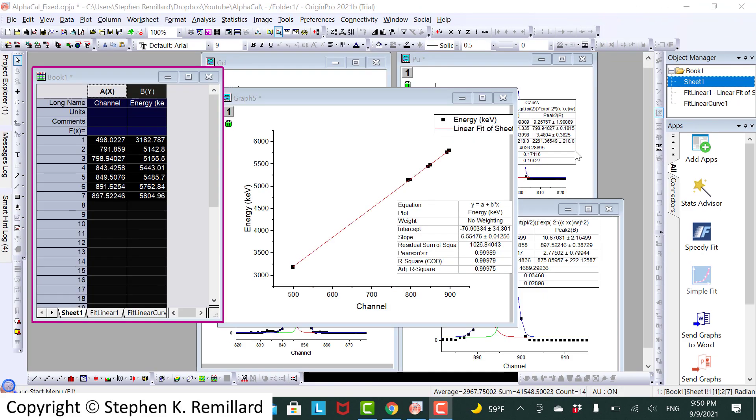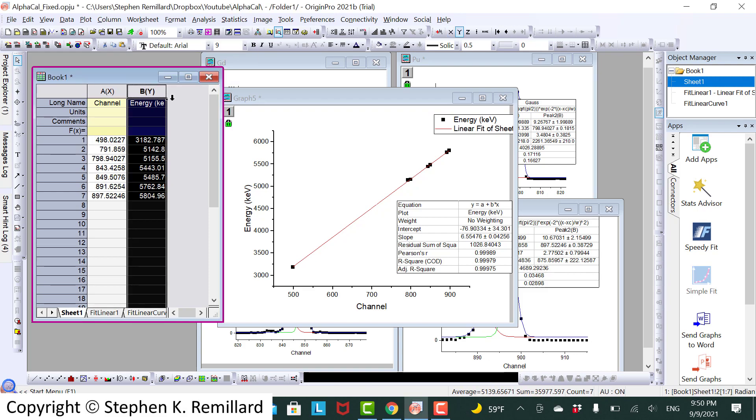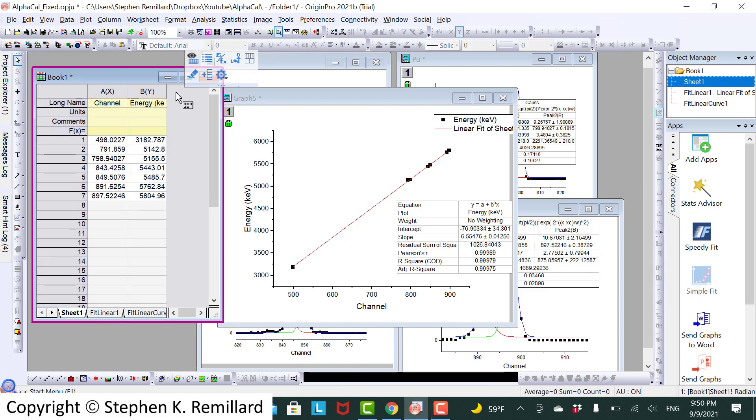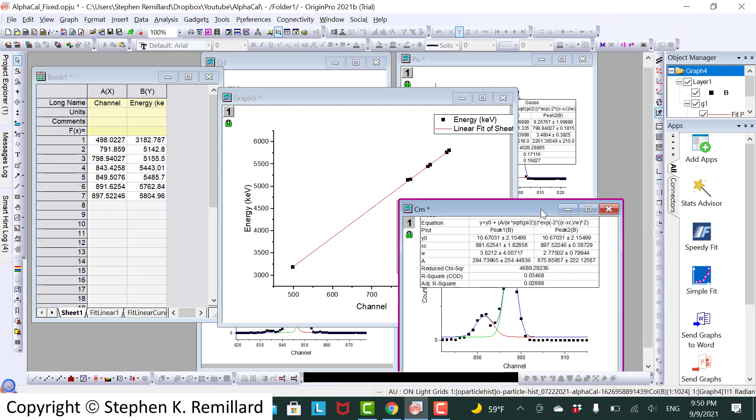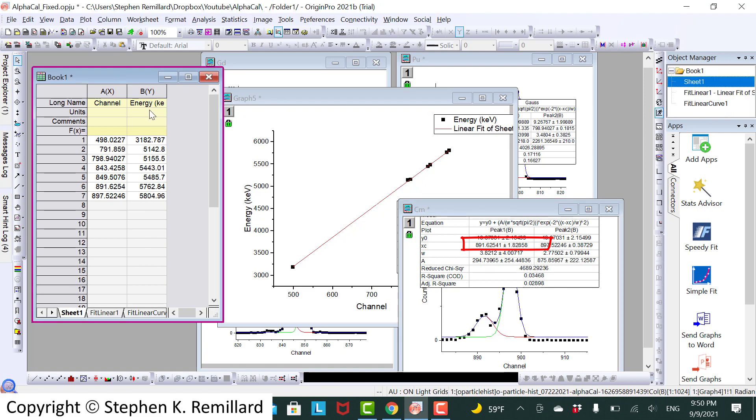One thing you might notice I did not do here is I did not add a column for uncertainties. Those uncertainties are available. Looking at the fits, we have the center with the plus or minus. So you could add another column for the uncertainty on the channel.